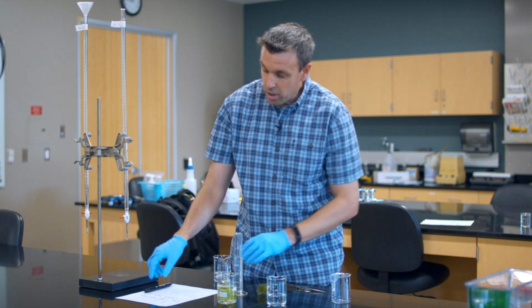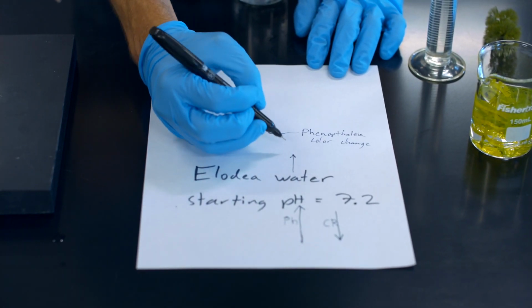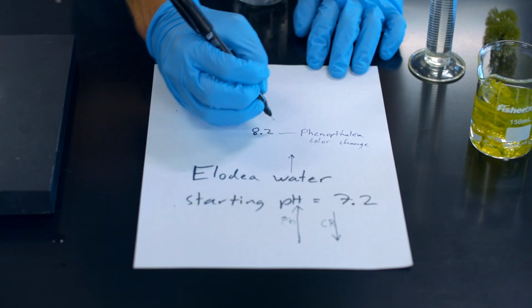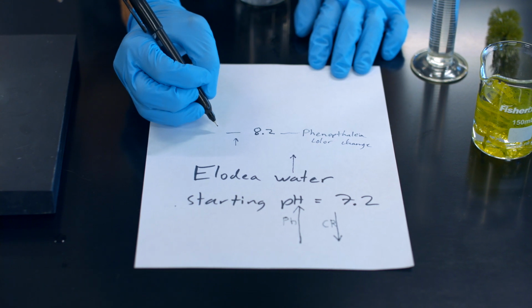And then we are going to use titration, just like with the cellular respiration lab, to see how much it takes to get to that color change. Only this time we're coming up to the color change of pink.